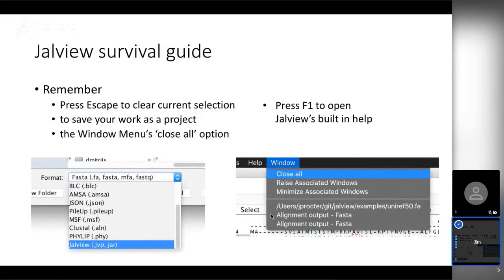There are a few things to remember when using Jalview. You can select regions by clicking and dragging across the alignment view. When you run an operation — like one of the programs Jalview connects with or computing a tree — Jalview uses that selection to do the analysis. It's like: select a region, then do something with it. If you want to work on the whole alignment, just press Escape to clear the current selection.